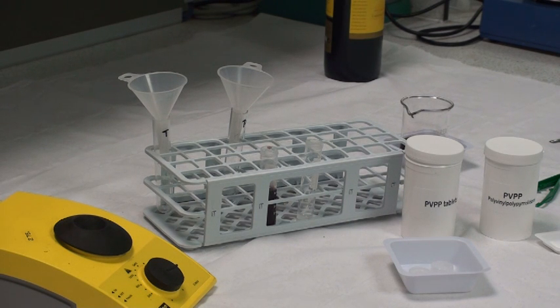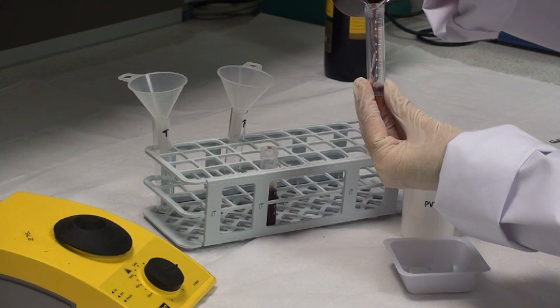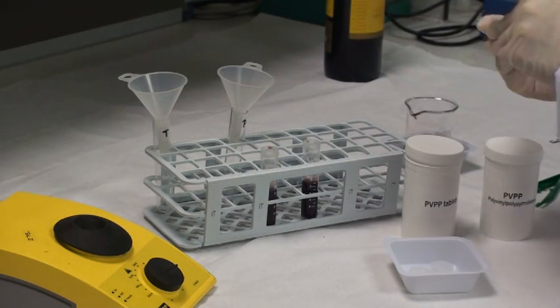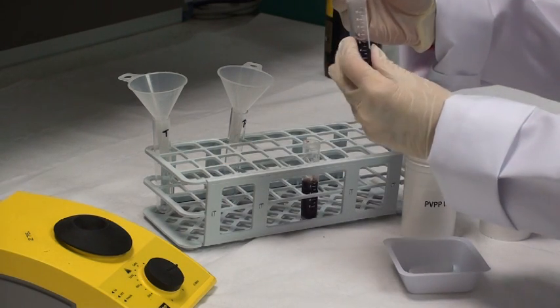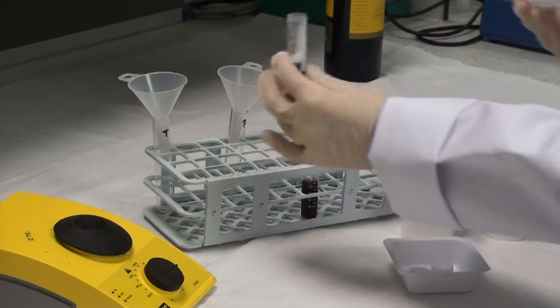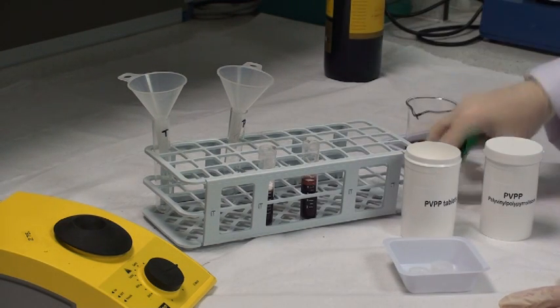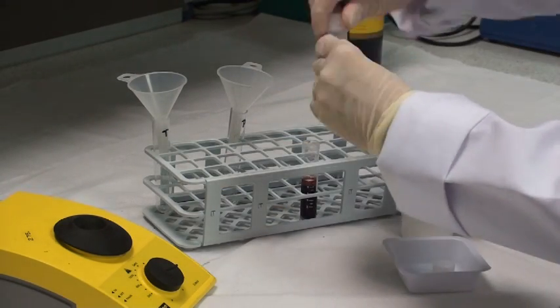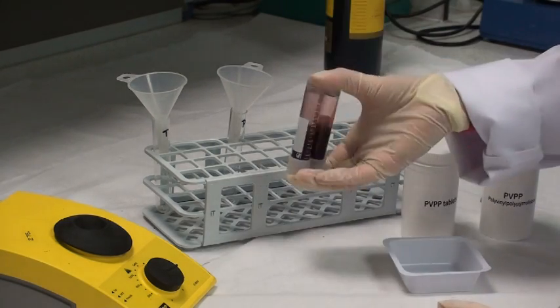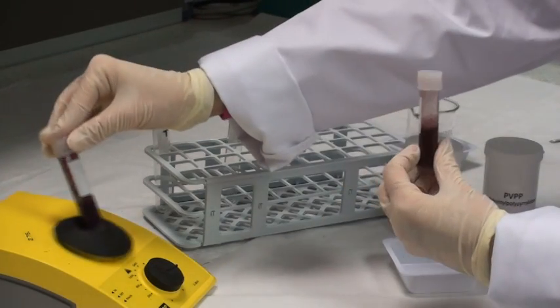For strongly coloured samples such as red wine, first add approximately 5 mL of the wine to a pre-calibrated polypropylene tube. Then add either 0.2g of PVPP powder or a tablet from Megazyme that contains 0.2g of PVPP. Cap the tubes, then mix them by vigorous shaking until the tablet completely disperses. If available, use a vortex mixer.